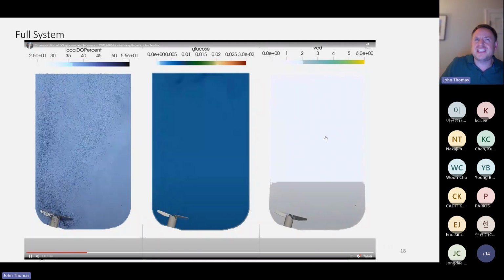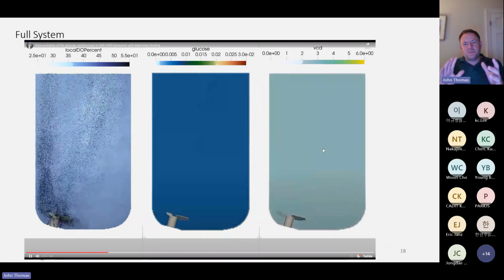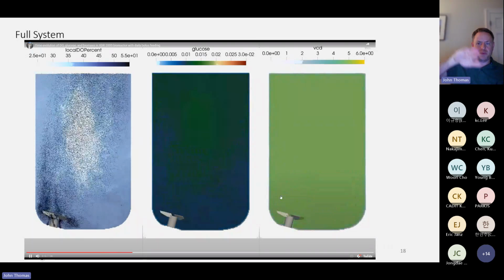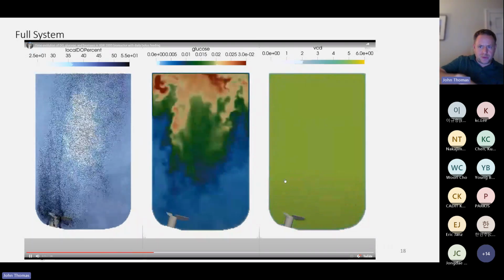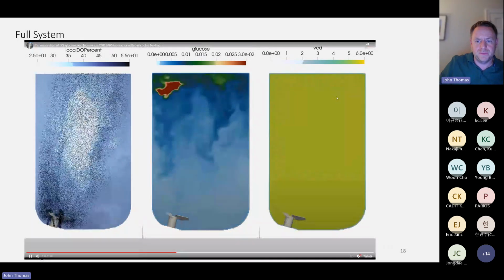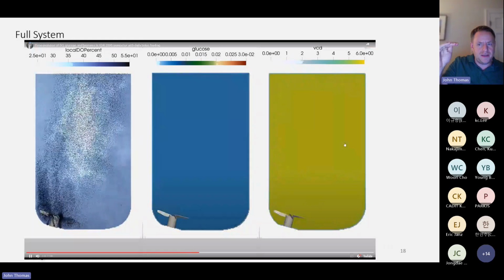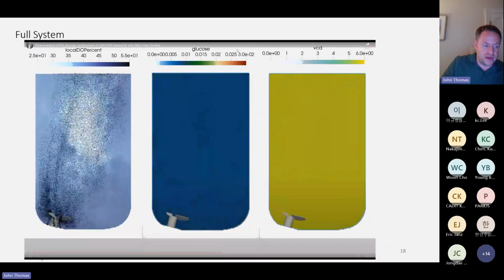And so we're not going to see spatial variations in VCD growth. We're instead going to see a pretty consistent viable cell density that's evolving over this multi-day process. Now, this is monotonic. We're going from low values up to around 5 or so as our cell density reaches its maintenance value. So we're not seeing variations in VCD, but the target value we achieve is a function of the DO variations and the glucose variations.